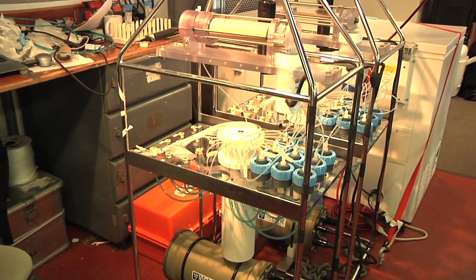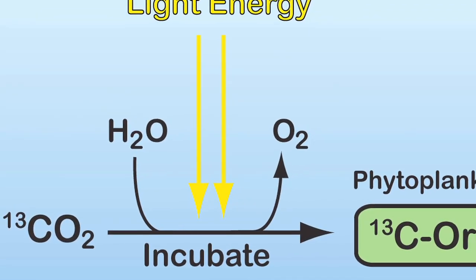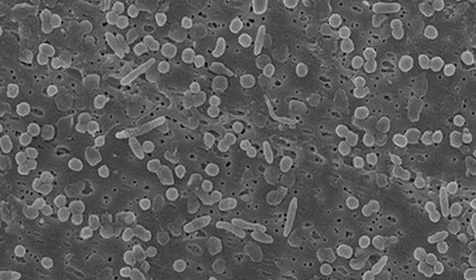The way we measure the rates of photosynthesis out here in the ocean is to do what we call a tracer incubation study. In doing this study, we add an isotopic tracer form of carbon dioxide. In this case, we use the heavy isotope C13 carbon dioxide, and we measure the rate at which the algae incorporate this C13 carbon dioxide into their cellular tissues, and how fast they do that over time gives you the rate information that you're after.